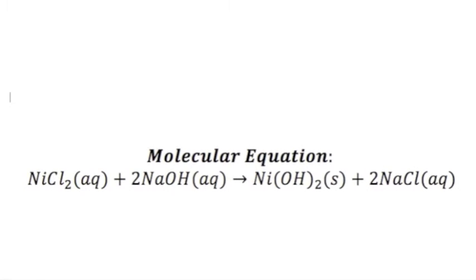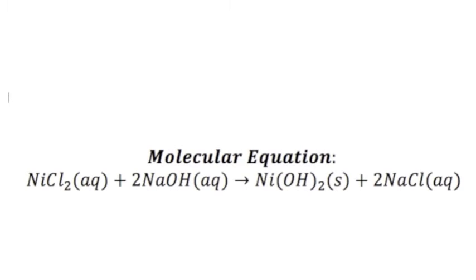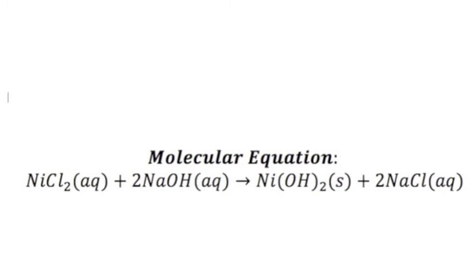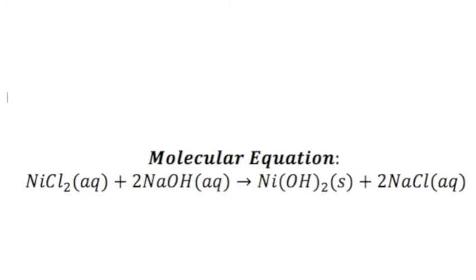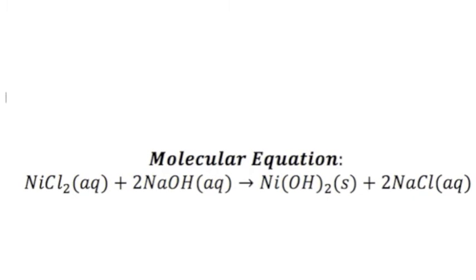This is the balanced molecular equation in which aqueous nickel 2 chloride and aqueous sodium hydroxide combine to form the solid nickel 2 hydroxide and aqueous sodium chloride.